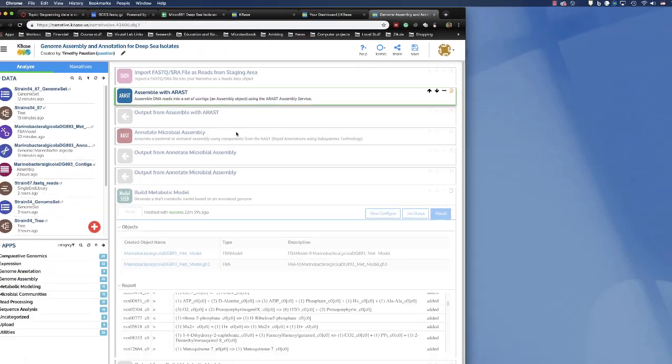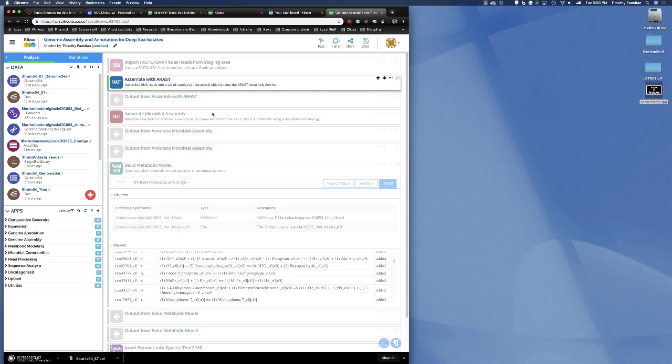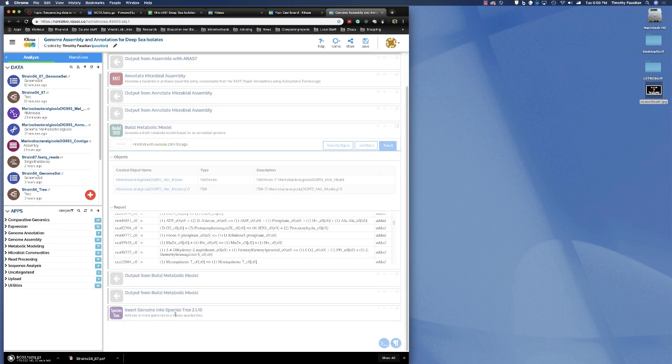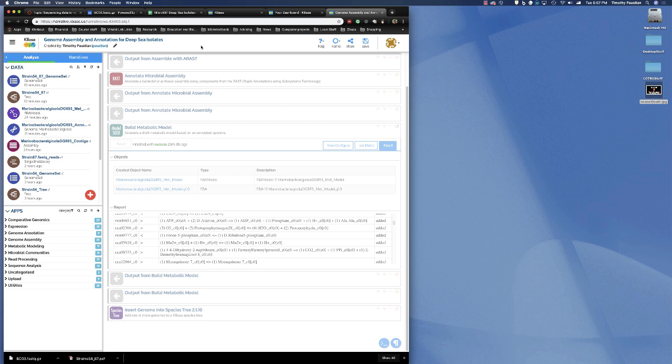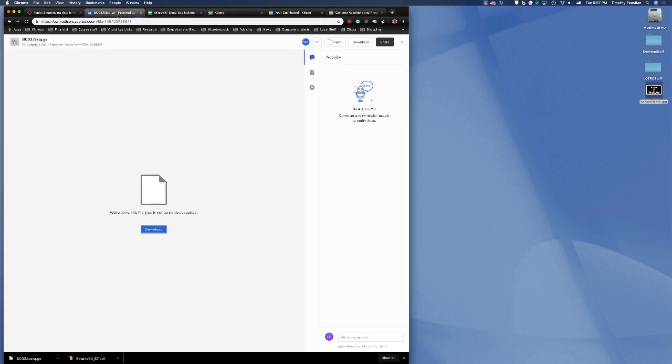Once we do ARAST, then it's very similar pipeline to what we did before. We're going to annotate the microbial assembly, then we're going to build a metabolic model, and finally, we're going to insert our genome into a species tree, and it will tell us where that genome fits in. Later on, I'll tell you guys how to identify the 16S ribosomal RNA and make a prediction. And Mark Barris is actually going to give me information on exactly how to do that. I should have those metrics by Wednesday.